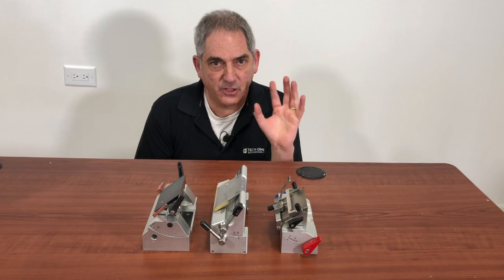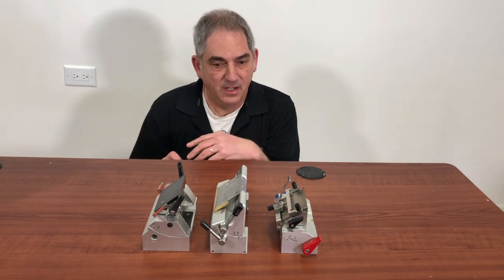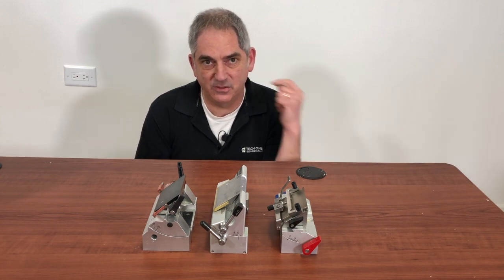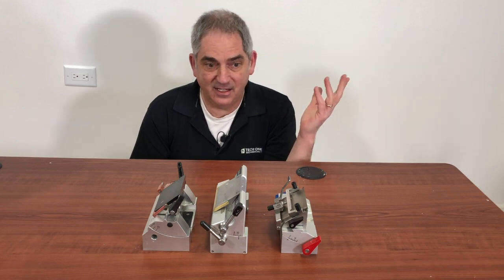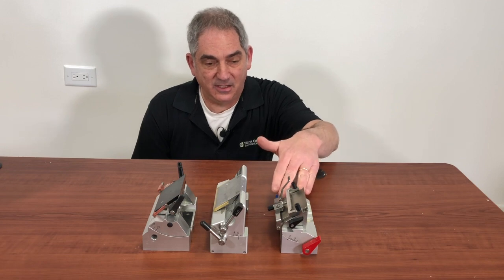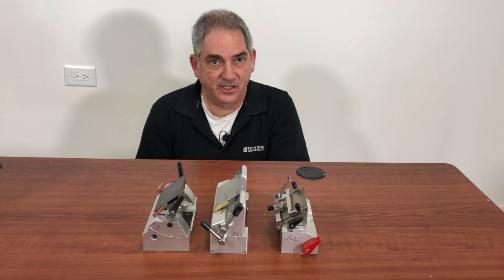Now keep in mind, these are general guidelines — they're not written in stone. I realize there are some blade manufacturers out there that use different angles on the actual blade. Another handy thing is, if it's set at the right angle and you're not getting good cuts, try changing the angle a little bit. You'd be surprised how often that will fix a problem.